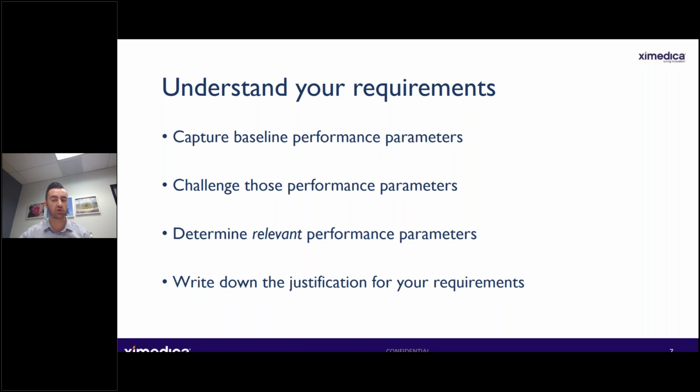This is a great way to get initial requirements down on paper, get them captured, but it should be probed a little bit further where possible. So if you could determine that there is minimal impact on your assay using plus or minus 1 degree of accuracy, it can open up more cost-effective options, different solutions, and provide a shorter development time for your own custom instrument. Similar scenarios can be presented for different areas of your protocol.